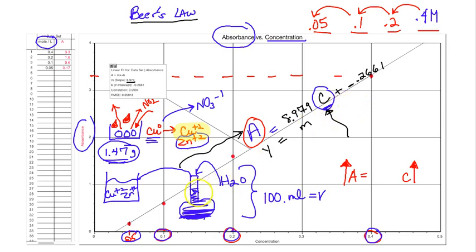Okay, well, we took this sample that was 100 milliliters and we poured some into a cuvette, an unsuspecting cuvette. I can't draw a cuvette right now, but you get the point. So we poured some into a cuvette, and then we put it through the spectrometer again. Now, we didn't add it to this curve. This curve is needed to solve for the C.